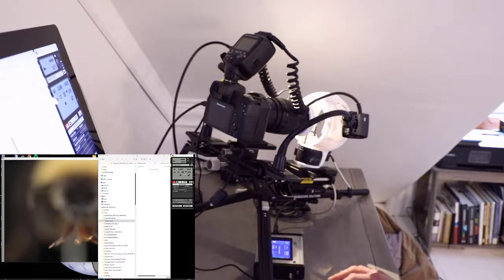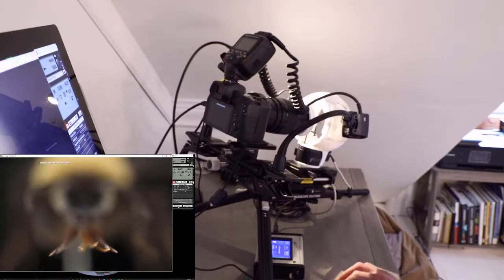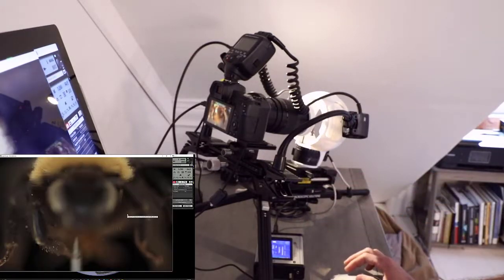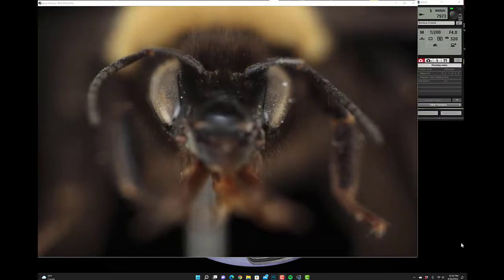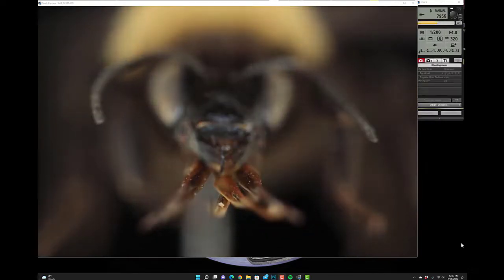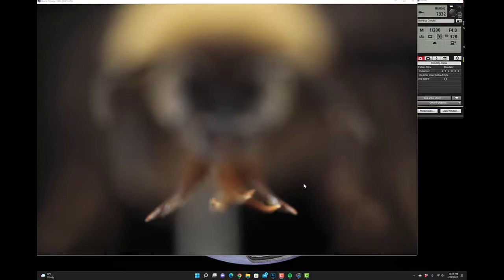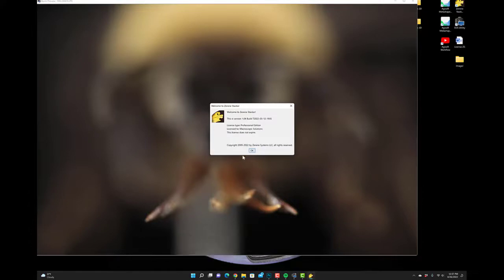And we're going to move forward and capture a complete image stack through this specimen. I'm going to open this up so you can see it a little bit better, and I'm going to press start on my StackShot controller unit. We're going to take 111 images through the head of this specimen. Okay, so that set of images is now being captured. What we're going to do is move forward and stack those individual images, and then we'll show you how to edit the dark areas using Photoshop.